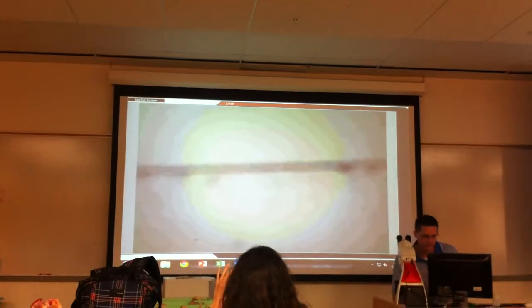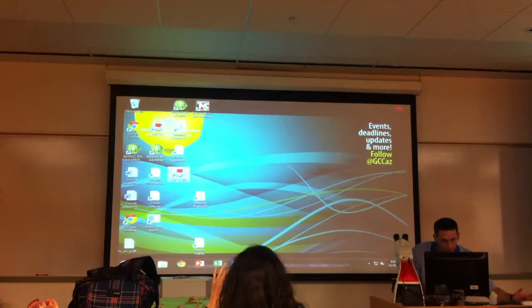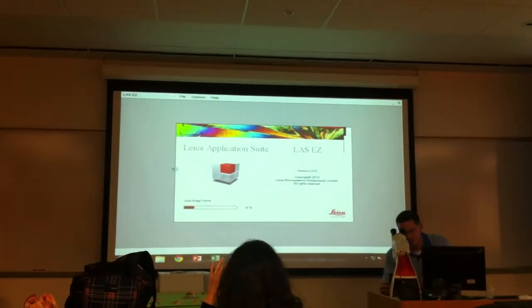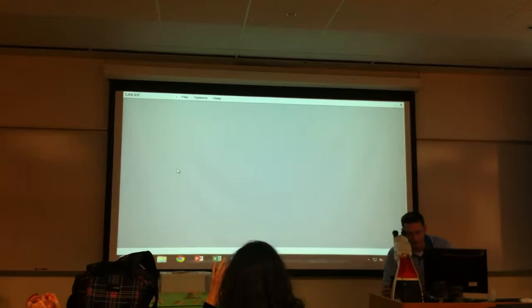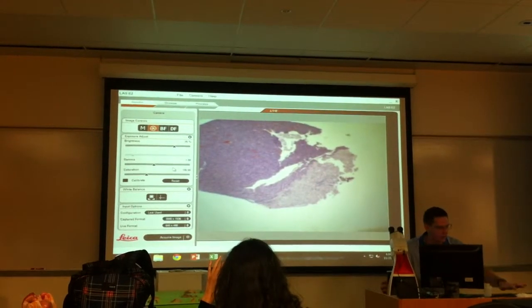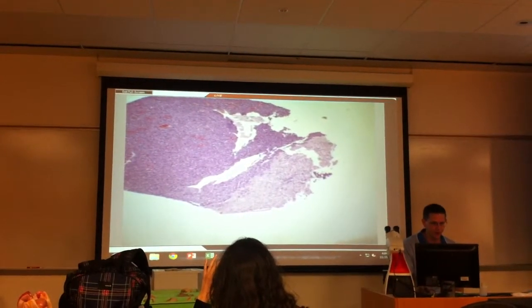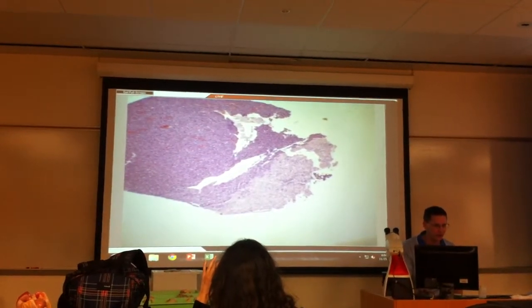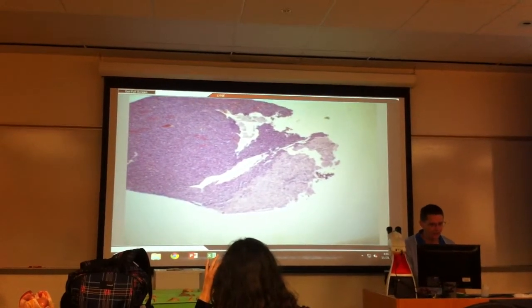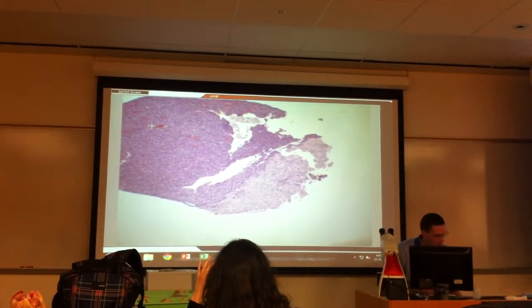Pituitary gland is primarily identified because the anterior and posterior are right next to each other with a pretty clear dividing line between the two. Mine's torn, don't let that throw you. But you see there's this whole light area over here and then this whole dark area. That split, where part of it's light and the other part is darker, tells you you're looking at pituitary gland.